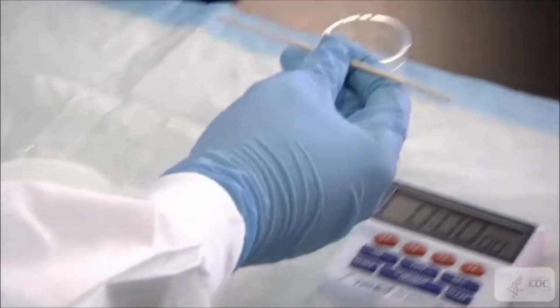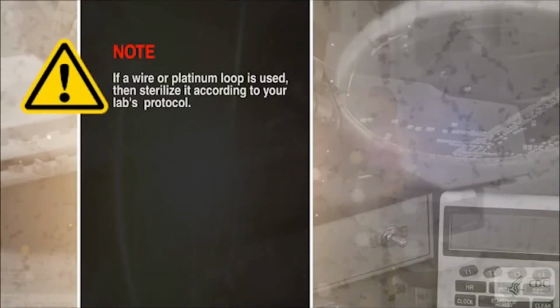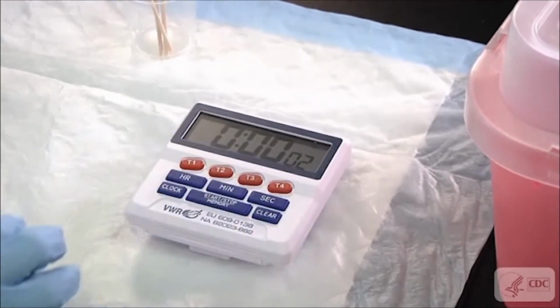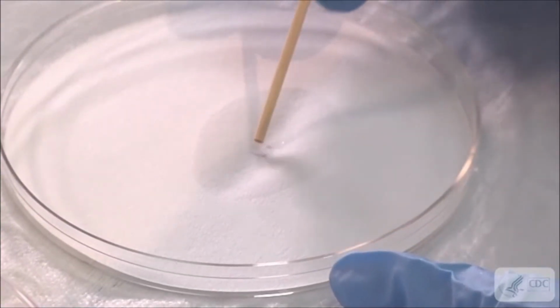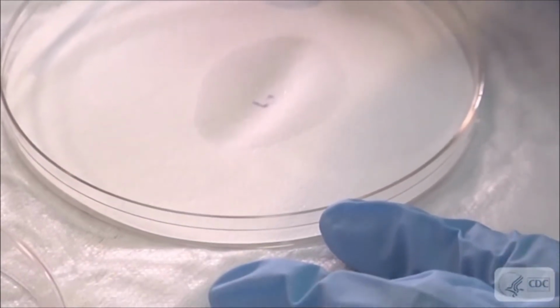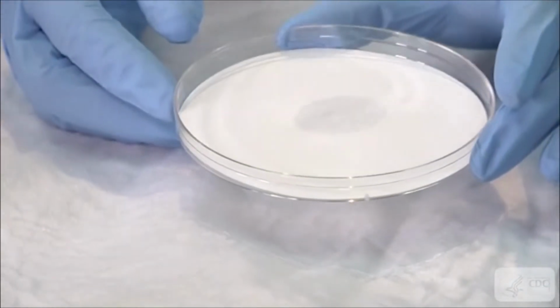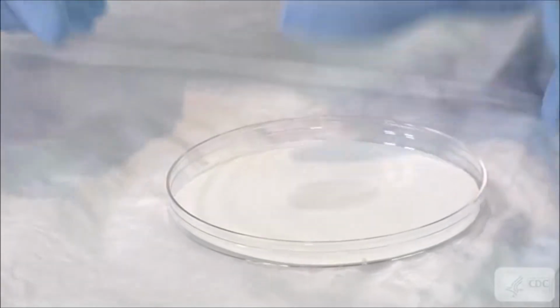Place the stick or plastic loop into the sharps container. If a wire or platinum loop is used, then sterilize it according to your protocol. Set the timer and observe for no more than 60 seconds. You have a positive reaction if the paper develops a deep blue color instantly or within 10 to 60 seconds. You have a negative reaction if the paper does not show any color change within 60 seconds.